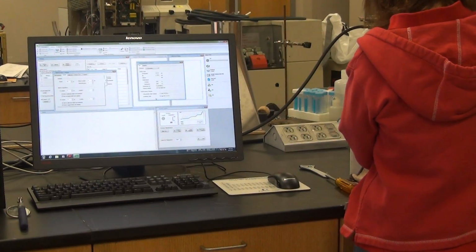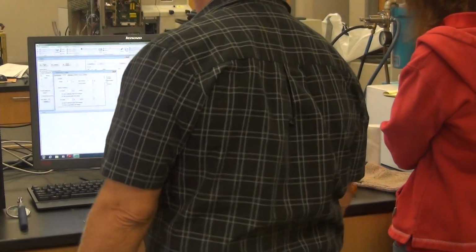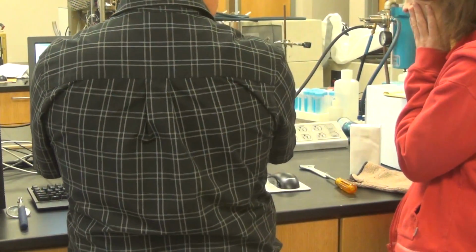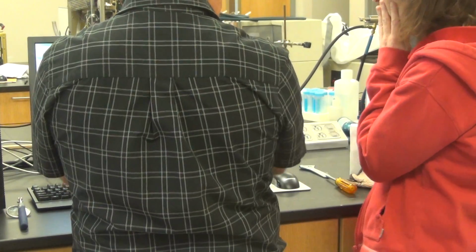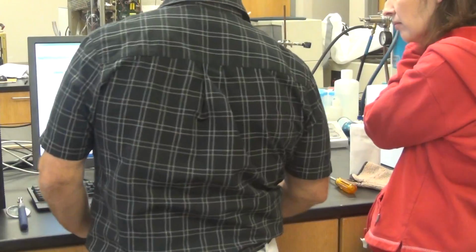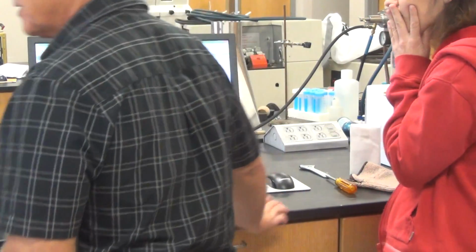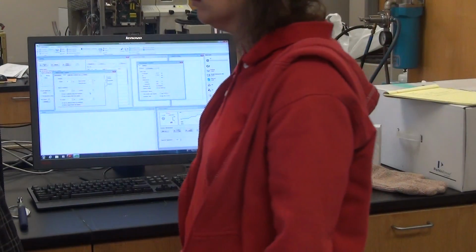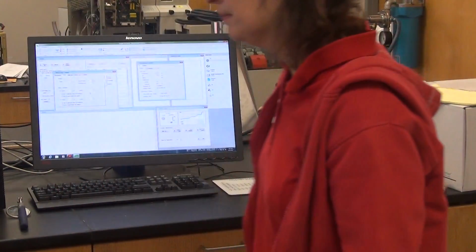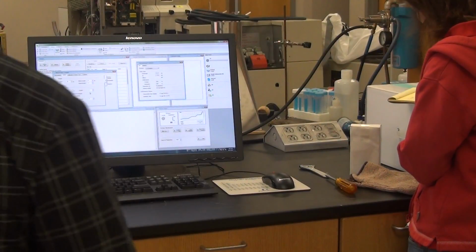You generally put 5 microliters in there. And they do two things. Either they make it temperature stable enough that you can take it to a higher charring temperature and not lose it, so that you get rid of unwanted stuff, or it makes it easier to analyze. So you tell it where your matrix modifier is. Typically, things that you're going to add to everything, you put in the big ones. Your standards, any kind of QCs, matrix modifiers go to the big ones.